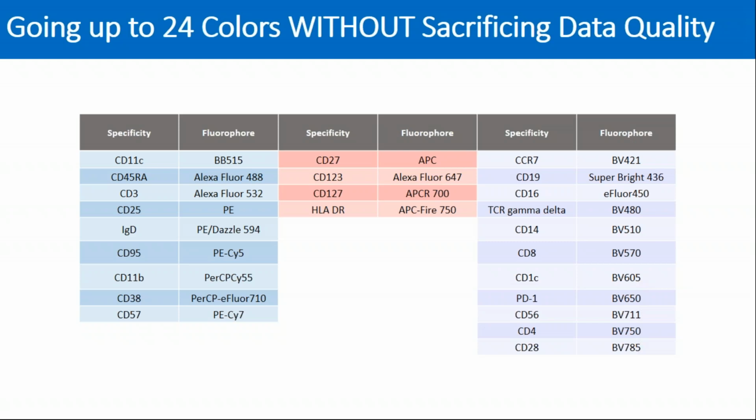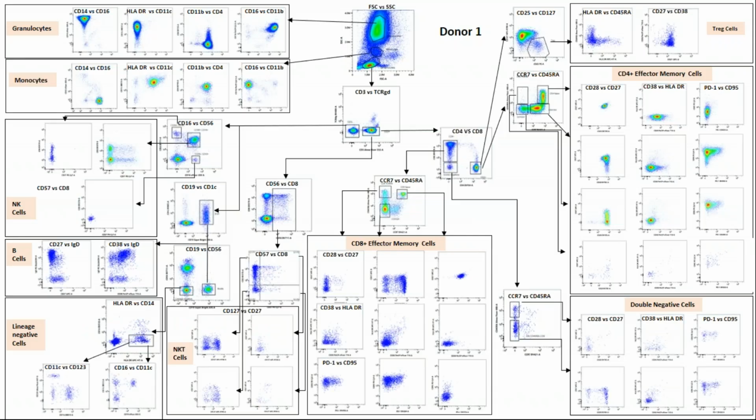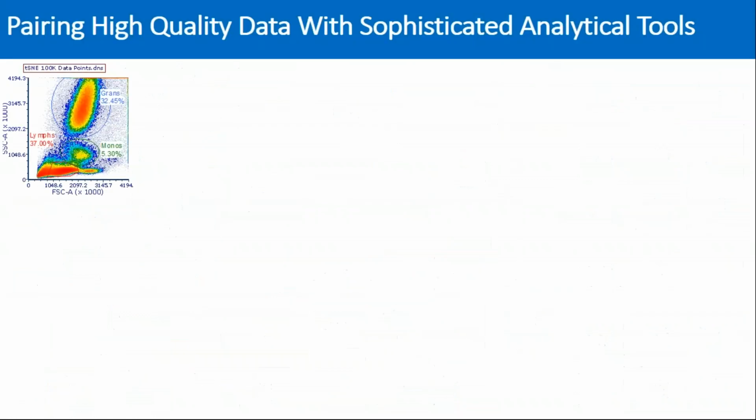But with a little thought and a little effort, we got this one tube to show us these 24 different antigens, which I'm showing you here with a light wash sample prep of human whole blood. And as you can see, you can get a whole lot of information, all from one tube with a spectral cytometer with 24 different dyes combined. And not only that, you get excellent resolution of your negative populations and of your positives. Look at these TCR gamma deltas and how they're coming off of these CD3 cells. Or over here on the right upper corner, you have this great separation of the Tregs coming out. There's many examples here that you can walk through, but let's keep going.